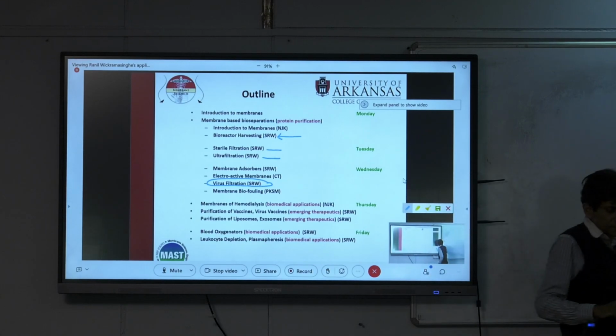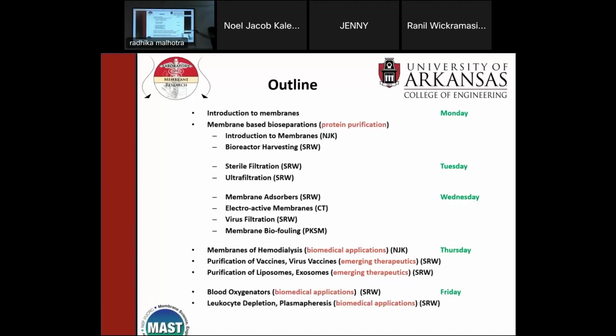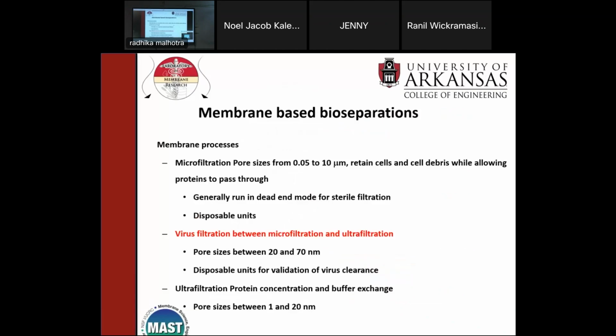If you remember, I mentioned yesterday, well, what did I mention yesterday about virus filtration? Let's see who remembers. What's the difference between microfiltration, ultrafiltration, and virus filtration? Anybody? Well, let's think of it differently. In microfiltration, what are we trying to do generally?